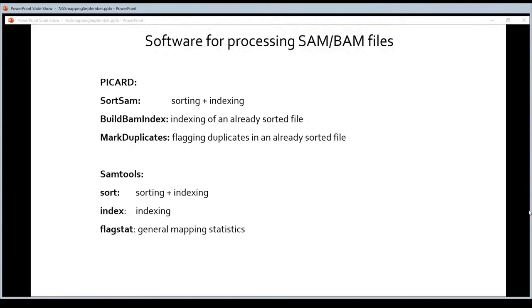For RNA-seq data, you can use these UMIs. So you add one unique UMI for every transcript. So if the transcripts are duplicated during the library prep, they will have the same UMI. But in bulk RNA-seq data, these UMIs are not heavily used. In single cell RNA-seq data, they are always used. In bulk RNA-seq, not that much.